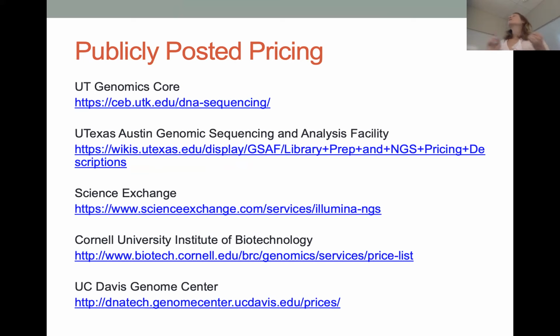There's a couple of reasons for that. That lab has very little experience with transcriptome libraries, but more than that, it's too low throughput. Almost all the RNA-seq designs that you want to do need more reads.